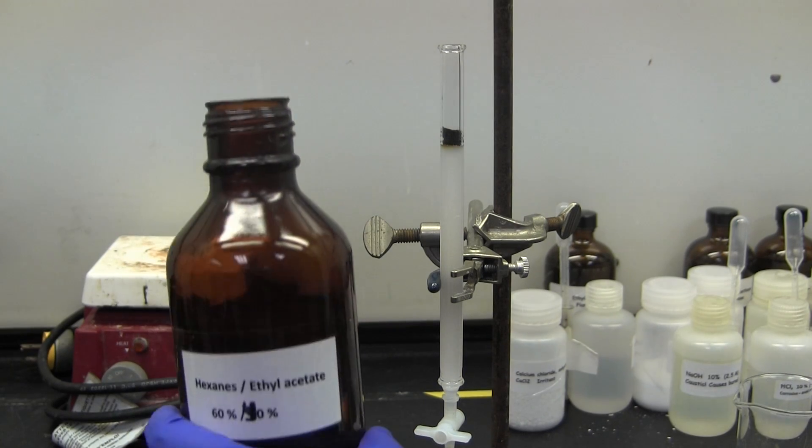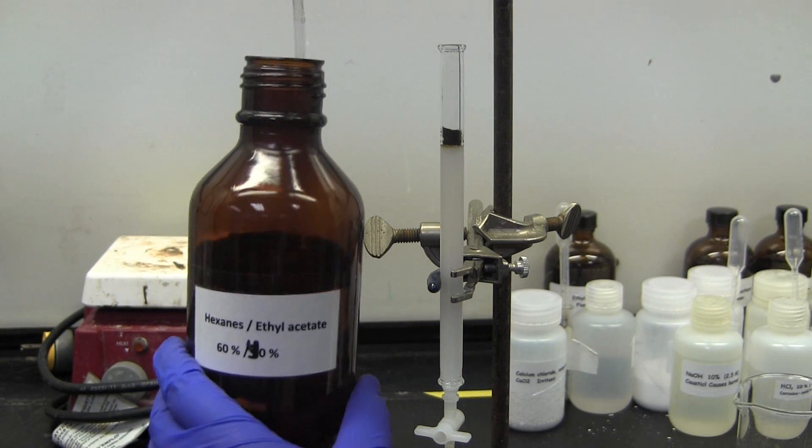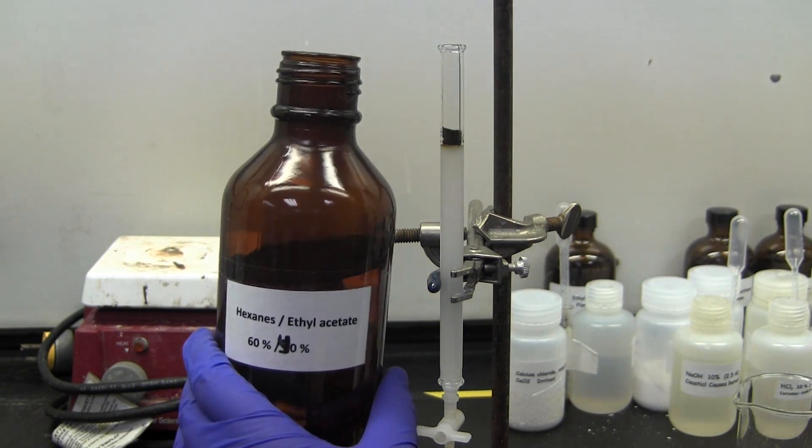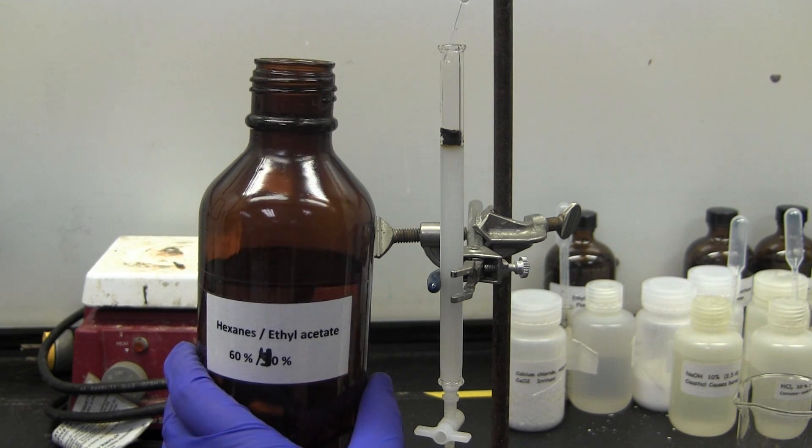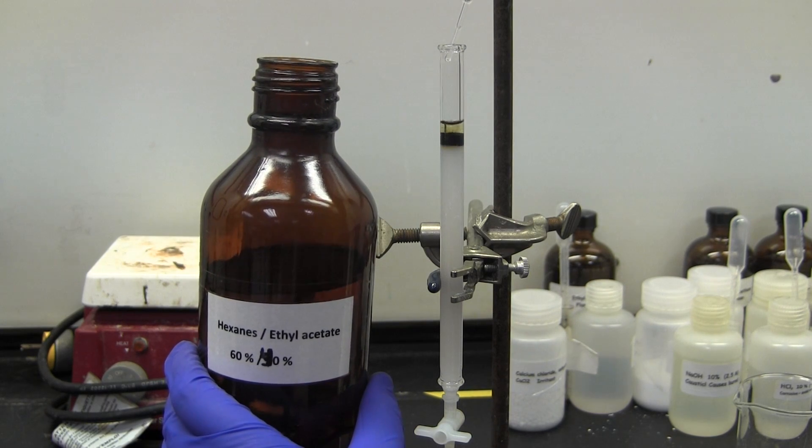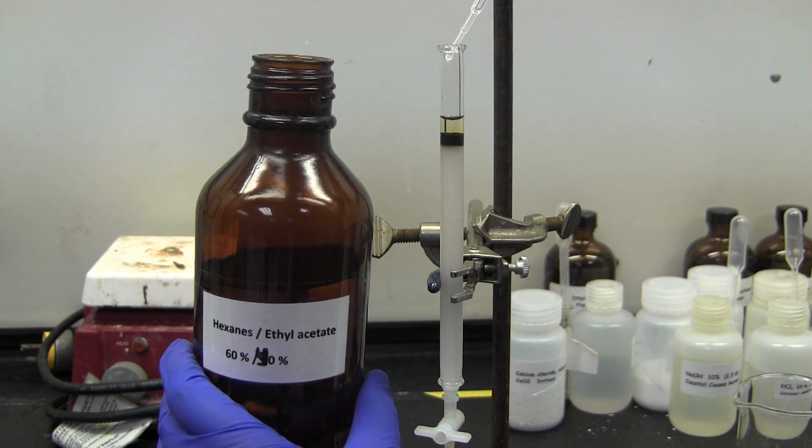Once you have loaded your unknown onto the top of the column, begin to add your chosen solvent mixture. Do not allow the top of the gel to run dry, meaning do not expose it to air. Always keep it covered with solvent.